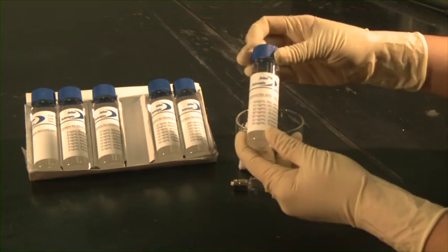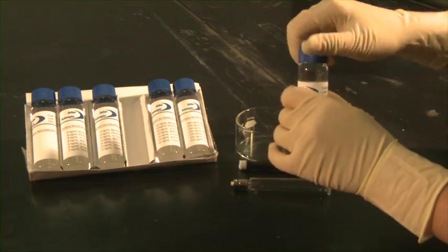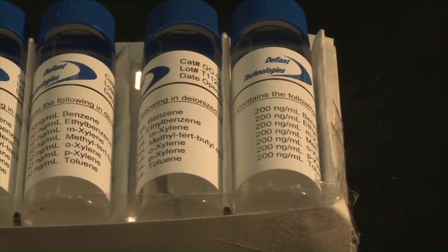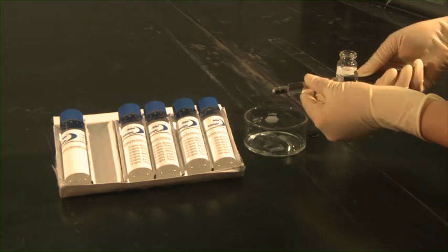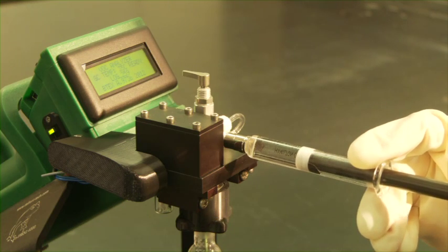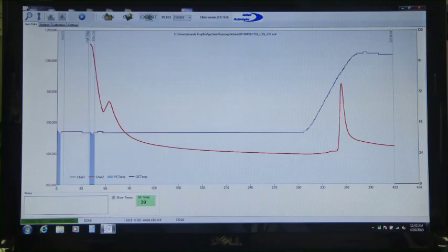Now you are ready to run your calibration standards. Start with the lowest concentration and continue to the highest concentration to avoid cross contamination. Load exactly five milliliters of the standard into the Frog, then click the start button in Elvin to begin the analysis.